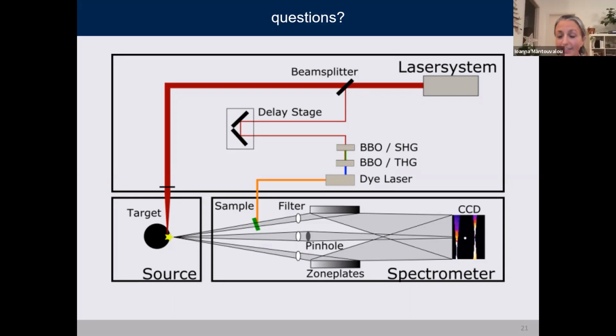I think the first, as I said, at the Max Born Institute, we have with 2 picosecond lasers a very similar source. So if you go to different laser systems, you can go shorter. If you go then even shorter, the physics in the plasma change. So I think in the picosecond to nanosecond range, the physics of the plasma is still very similar. If you go shorter, other effects take over, and then you get more hard X-rays and not soft X-rays anymore. But it is already our system. When we bought it, it was designed for 10 nanoseconds. So it is not easy to get lasers with 1 nanosecond or 500 picoseconds with such high energies.